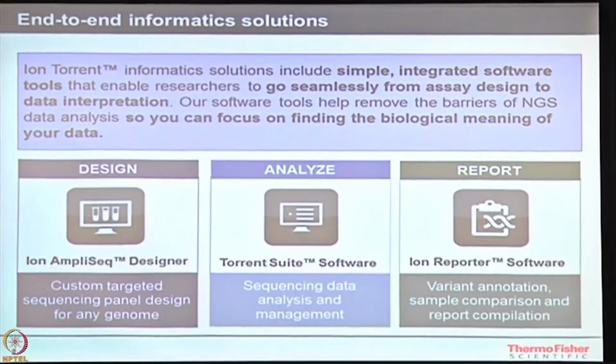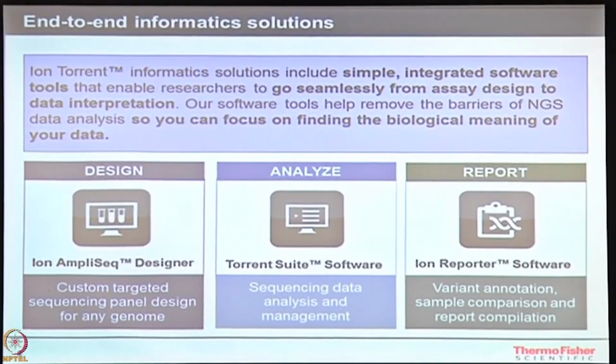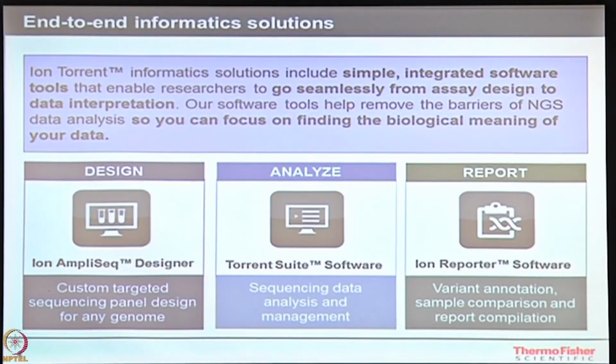So, you must have heard yesterday about something called as target sequencing, yeah. It is something like your genomics is targeted for particular region or it may be your genes that you are studying are targeted for a particular region through primers, and you then pick them up and go forward with sequencing. Okay. So once you start sequencing, that's the first part what we look for, that is the design. So you are targeting particular regions for particular variants.